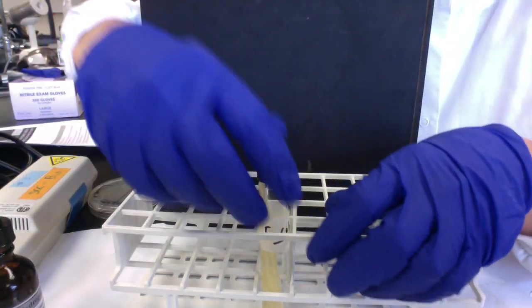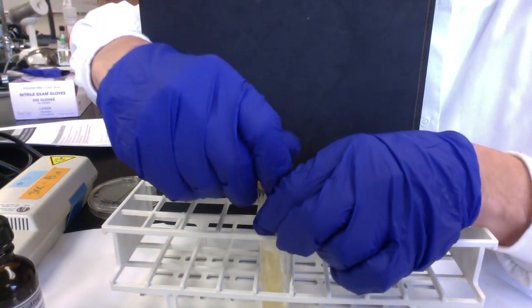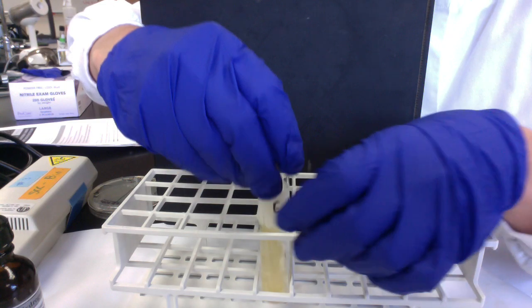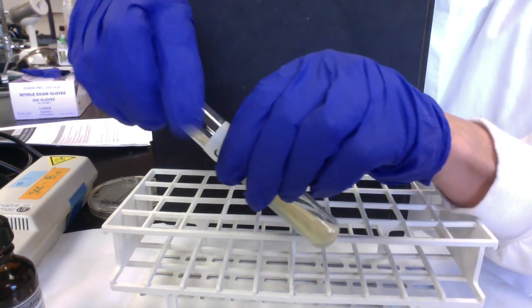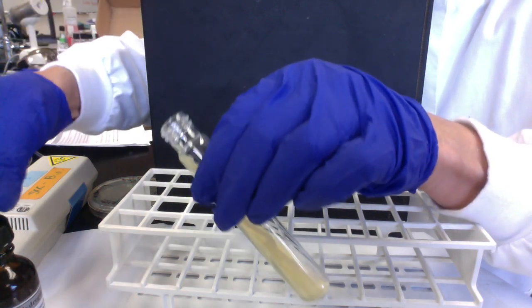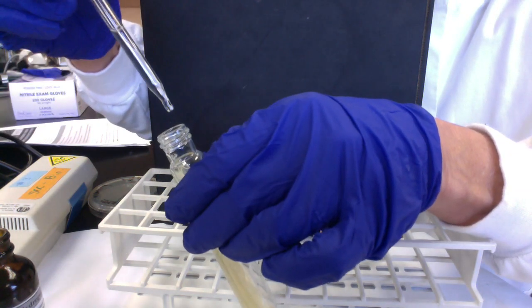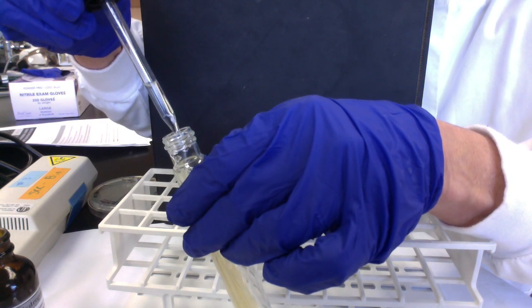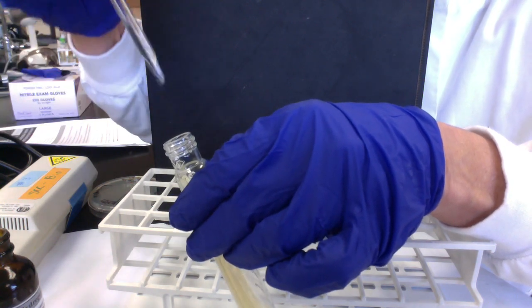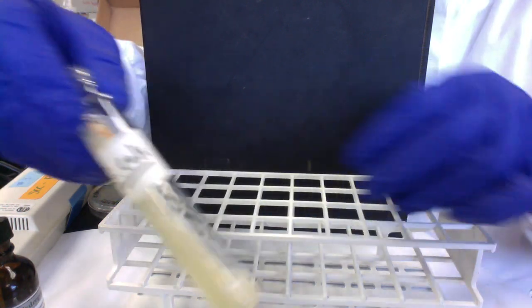So I'm just going to take my hydrogen peroxide. Since E. coli carries out aerobic respiration, in addition to anaerobic respiration and fermentation, this little guy should be catalase positive. So I'm gonna drop my hydrogen peroxide right into the slant, and let's see if we can't get some bubbles here. You recall the staph epi we tried was such a weak positive.